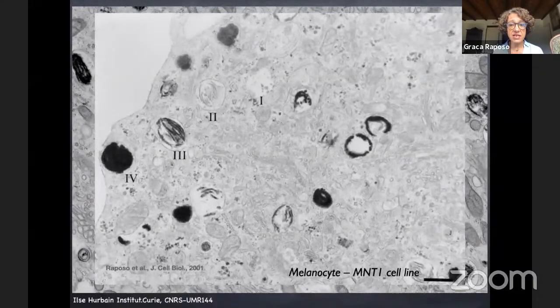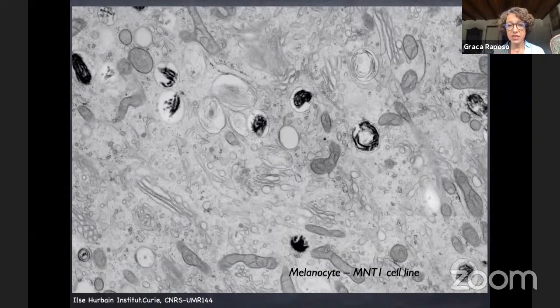I have here an example from a paper in 2001. Here it's chemical fixation. Maybe you'll say, okay, it's also nice. But if we are going to measure the organelles, you can really see a difference. Although we can also see these very nice little fibrils in these immature melanosomes that don't have melanin yet, they are much less preserved. And with our experience, we now know that using high pressure freezing we can preserve all these structures and contacts much, much better.